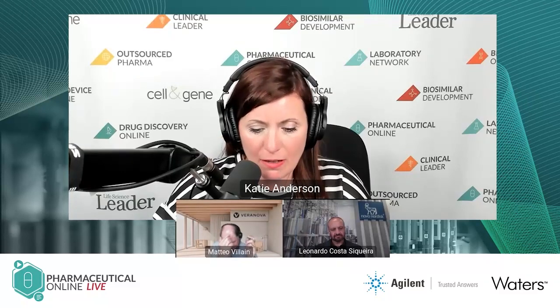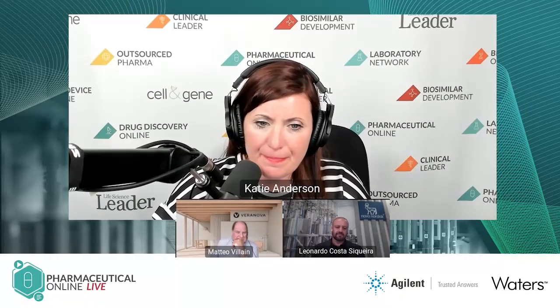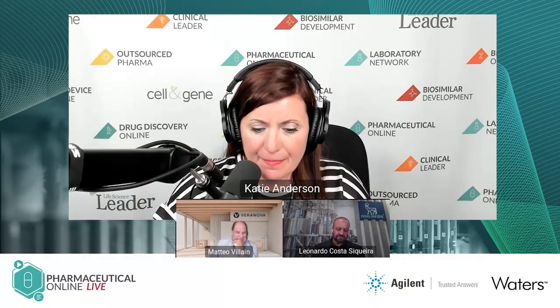Leo, earlier you mentioned NIR spectrophotometry, and I'm curious if you can elaborate a little bit on how that improves the efficiency of process verification and analytics. Actually, we use it mainly in our not so continuous process, where we need, for instance, to calculate the concentration before we load the columns, to have better efficiency and also extend the lifetime of the resins.